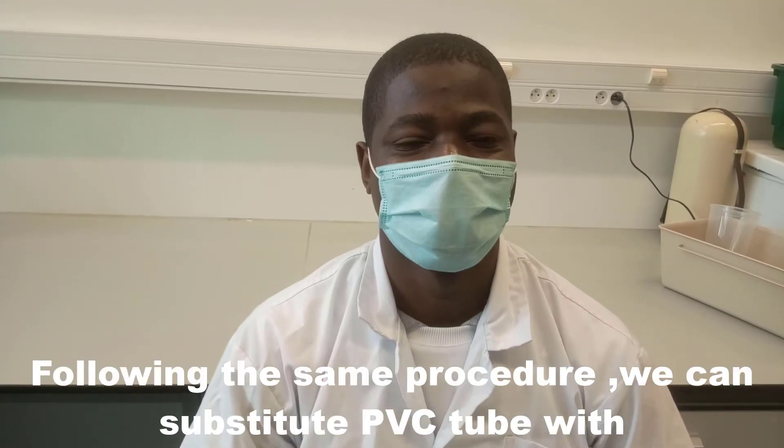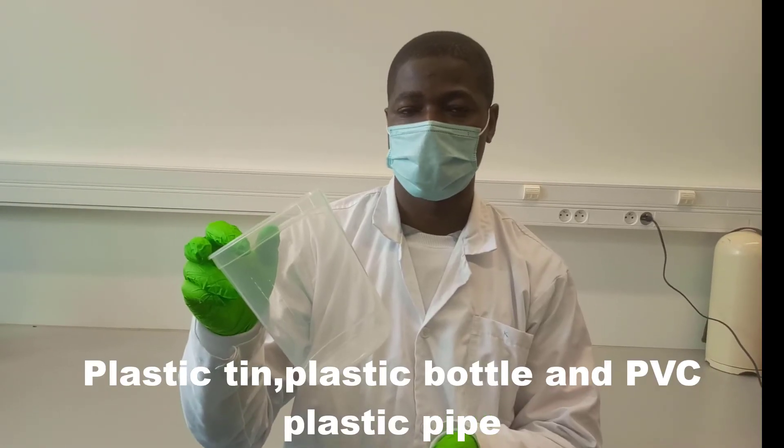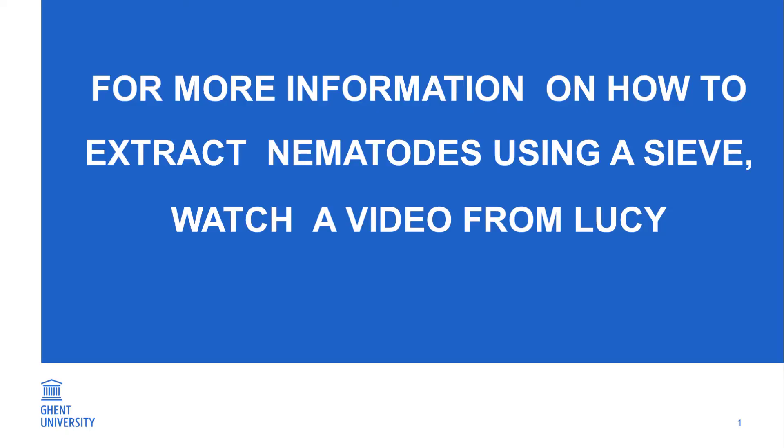Following the same procedure, we can substitute the PVC tube with a plastic tin, plastic bottle, and PVC plastic pipe. For more information on extraction of nematodes using a sieve, please watch a video by Lucy. Thank you.